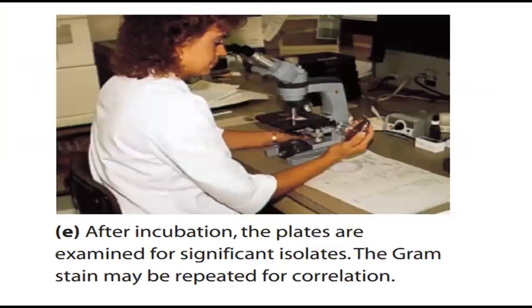If you look here, you can also detect the motility of the microorganism with the help of a microscope. You will take an inoculum, streak it over a glass slide, add a few drops of water onto the slide, and then check it under the microscope. If your cells are moving, you can say that they are motile, or if they contain flagella, you can easily say that your cells are motile. So it also gives information that I am dealing with a motile microorganism.